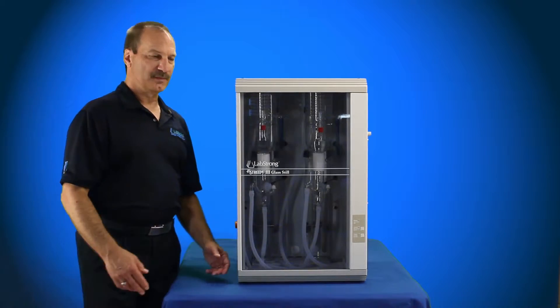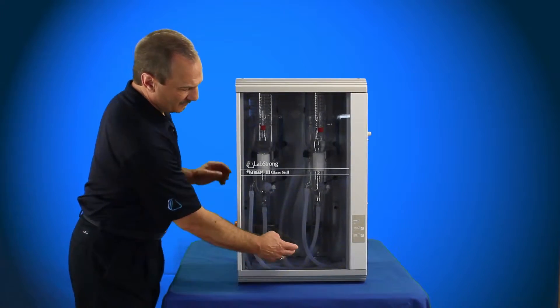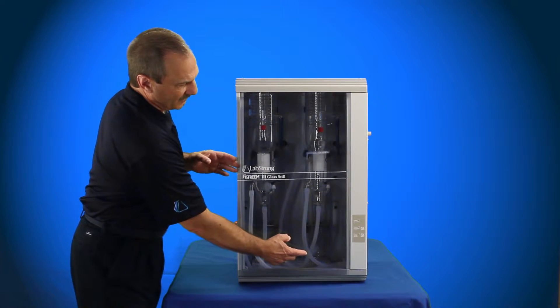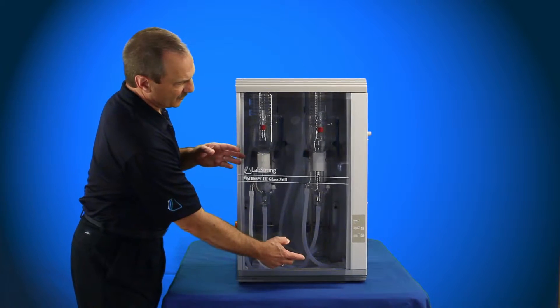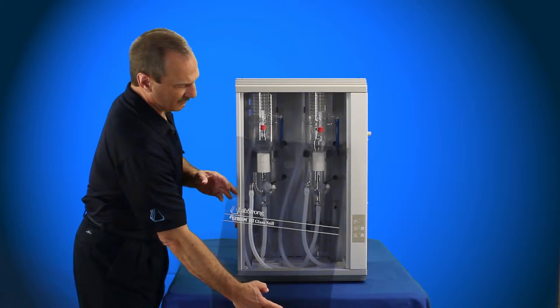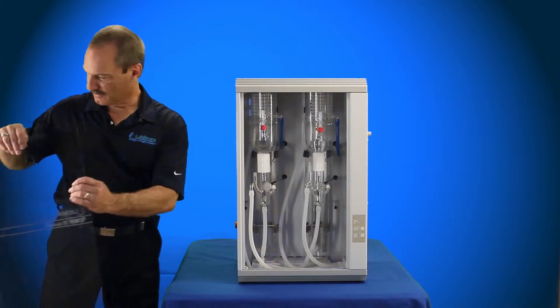Now we're going to remove the door from the 8-liter per hour Fi-Streem III system. The Fi-Streem III 4-liter per hour single distilled has the same type of door, it's just a little smaller. You're basically going to lift up, pull out of the bottom, pull the top down, and you remove the door. Set that aside.